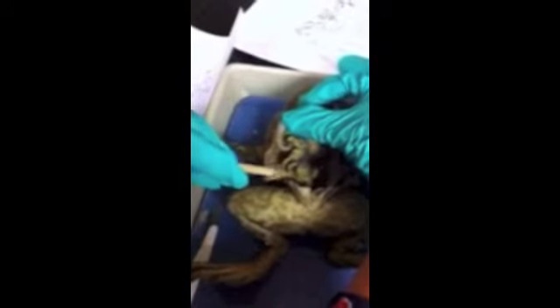Next is the large intestine, so we follow the small intestine all the way to over here to the large intestine, which is what I'm touching right now. The large intestine flows from the small intestine and leads to the rectum.